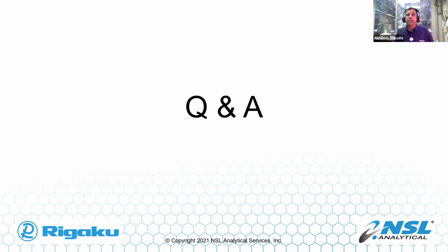Dave, do you want to add something to this? Yeah, I've never seen an actual instrument where it was combined, but going into XRD, having that XRF or some other chemical information is a huge head start in identifying and matching up to the proper pattern. So you almost need to have both of those sets of data together. Very good, thank you.